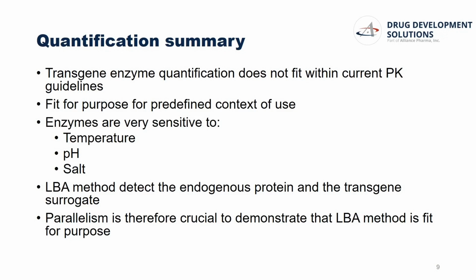When developing these enzyme quantification assays, it's important to take into consideration temperature, pH, and salt, because they can have a detrimental effect on your enzyme and therefore might mean that the quantification of your samples might not necessarily be accurate. So it's important to take those factors into consideration.